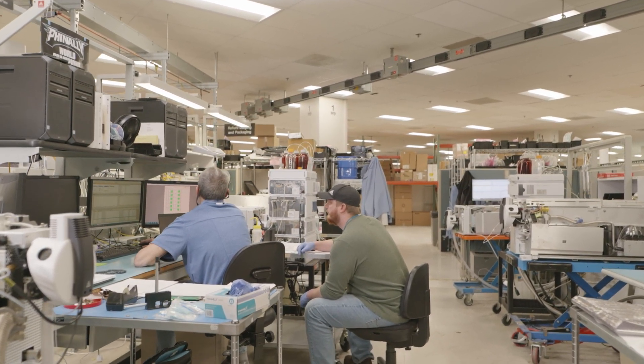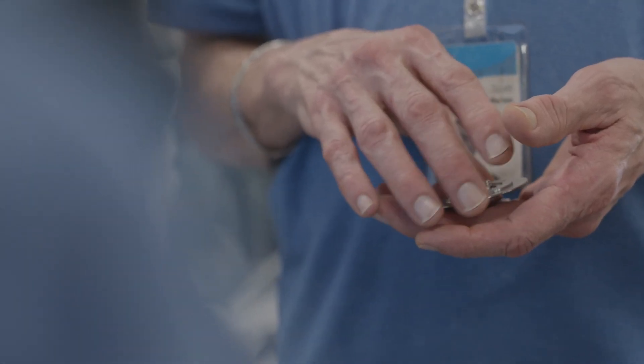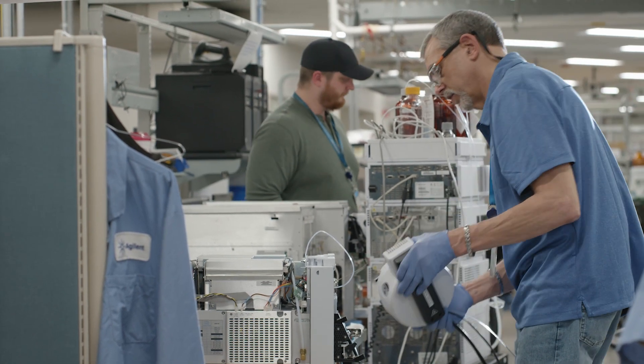We remove the whole flow path and clean that. If I don't like the look of something on an instrument I will change it out. If it looks worn, if it seems like it might be the least bit compromised, it gets changed out.